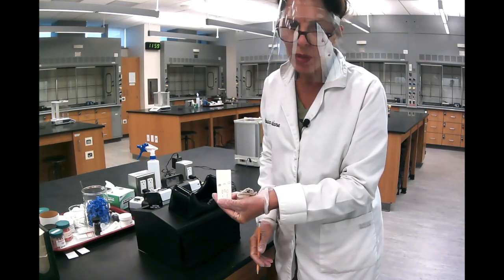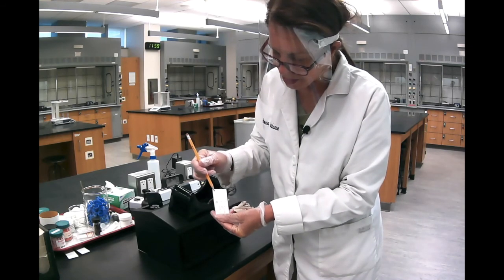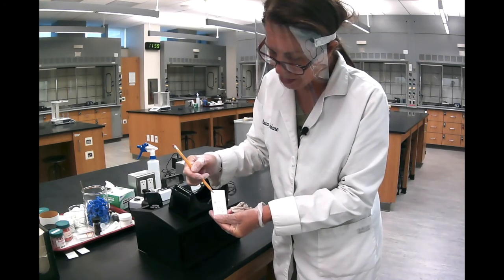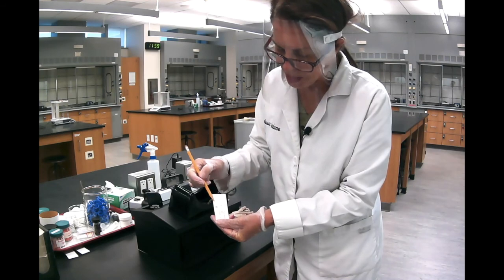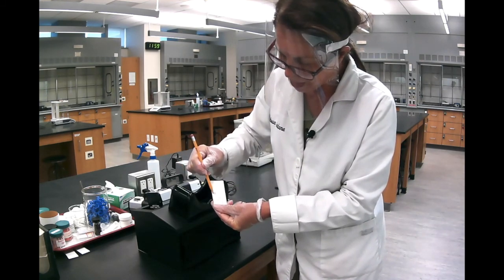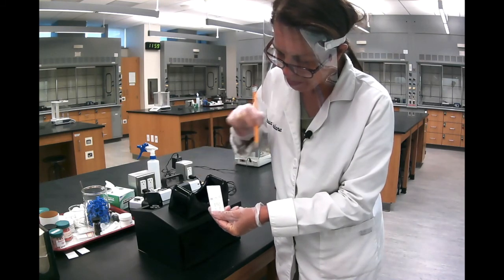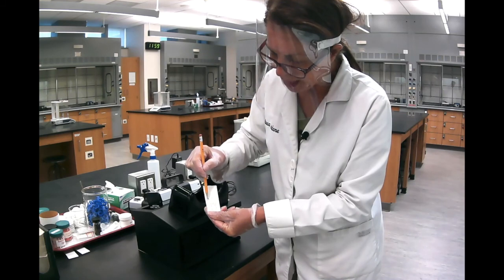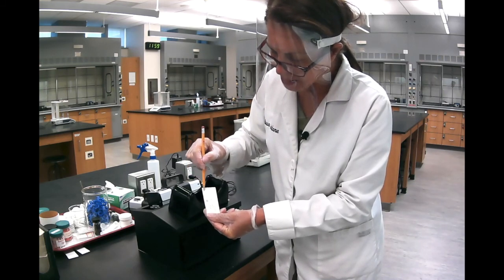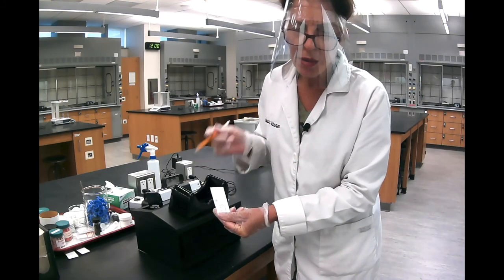And at this point, you can measure the distance for the solvent and the distance for the substances. So for each substance, you take the middle of your spot and you measure the distance from the starting point to the middle of the spot, and then you divide that distance by the distance traveled by the liquid, and that would be your Rf.